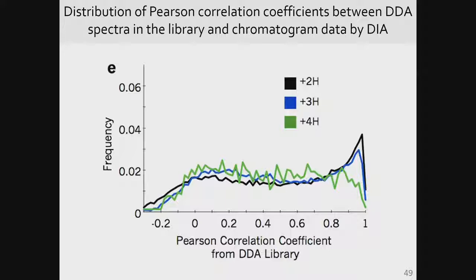And of course, with the chromatographic DIA data, it was collected at a collision energy that was optimal for doubly charged. Does that make sense? This is kind of a key component, and this will lead into some things later. What I'm presenting are some of the problems that we have with doing DIA on Orbitraps today. But how we're trying to wrestle through them and improve upon them is going to be more on Thursday, some of the more advanced topics.